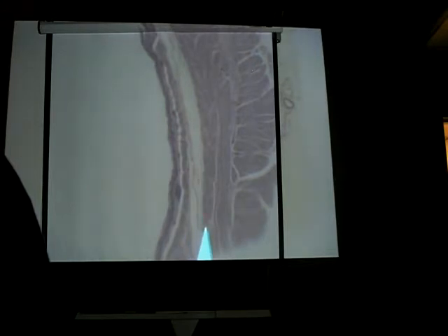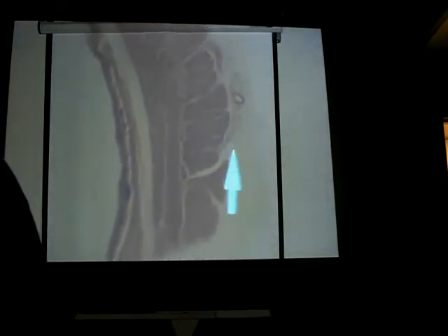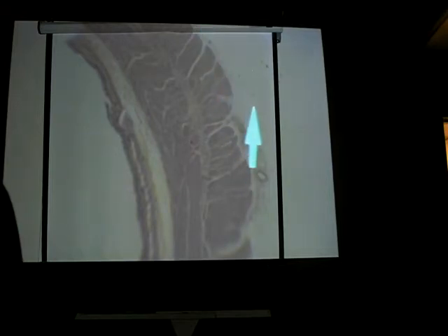And in the esophagus, that's where you find your esophageal glands. Then you have your muscularis externa, which is usually a pretty thick piece of muscle. And then you have your serosa or your adventitia, which can have a little bit of connective tissue, probably some adipose, a few blood vessels and all that. So the serosa, if it contains a simple squamous lining, then it's called a serosa. If it doesn't have that, it's called an adventitia.